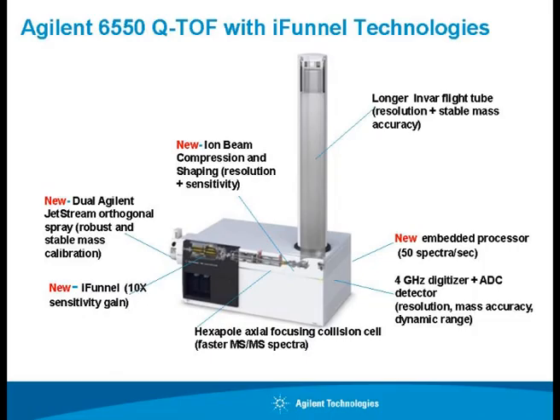But we are saying here that my mass spec cannot see mass as such. It has to be charged, meaning the language which my LC is talking cannot be understood by my mass spec, isn't it? So we need an interface, which is called an ion source, or in this case electrospray ionization. That is an interface where the liquid is evaporated and only charged analyte, in this case peptides, gets into the mass spec, which is under high vacuum.